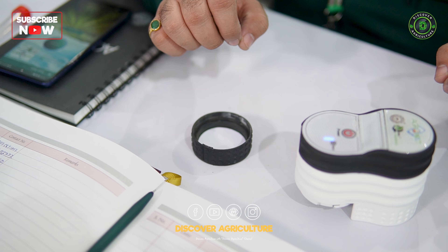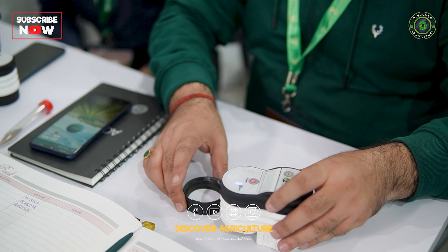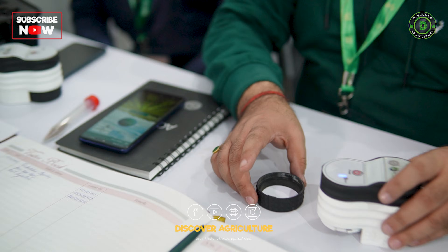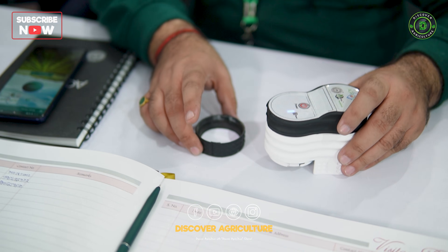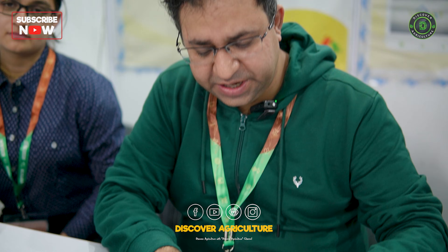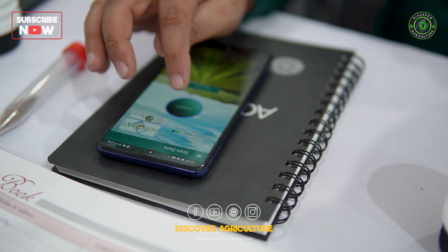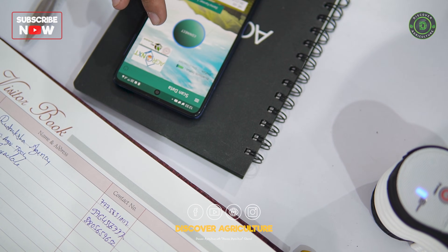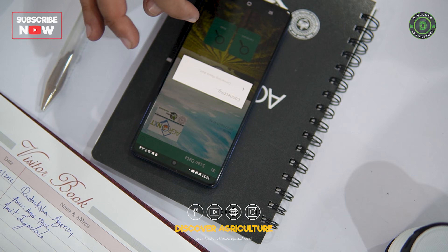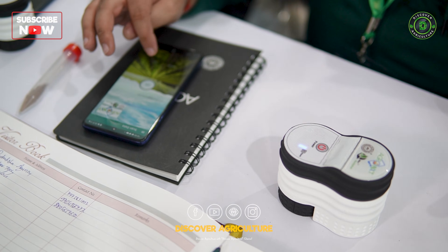We just require 5 to 10 grams of the soil sample. Before scanning, we first need to carry out the calibration of the device. For calibration, we need to first pair the device and then click on the calibrate tab.